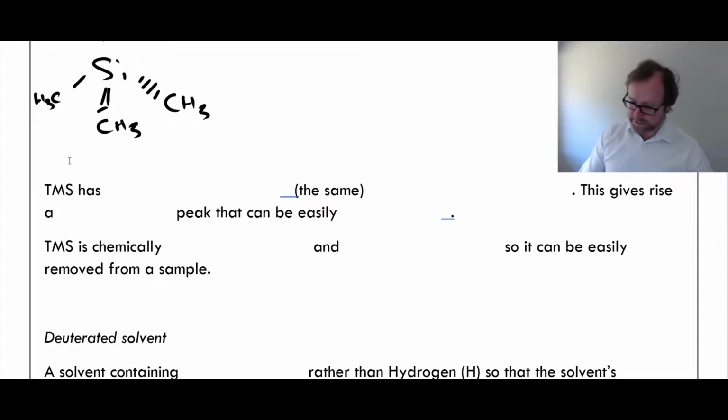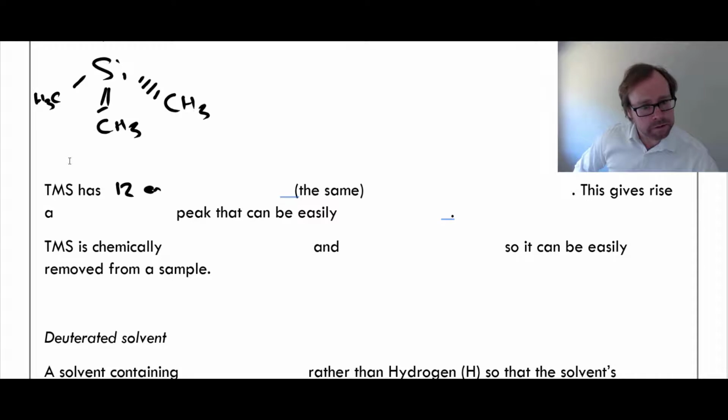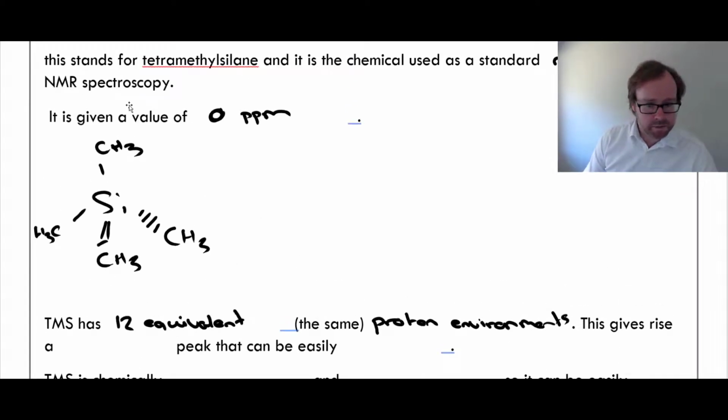TMS has 12 equivalent proton environments. So I've used this word equivalent. Okay, so 3, 6, 9, 12. So it has 12 equivalent protons.